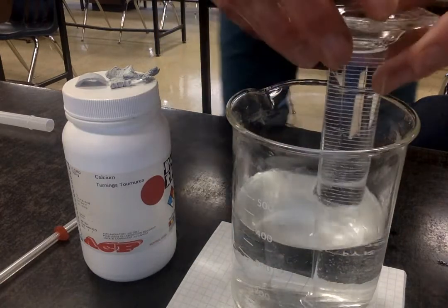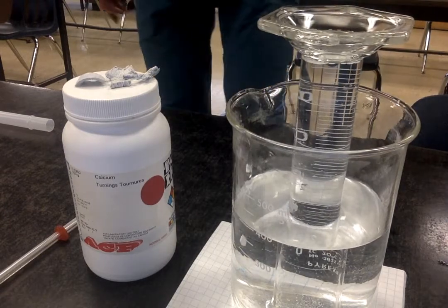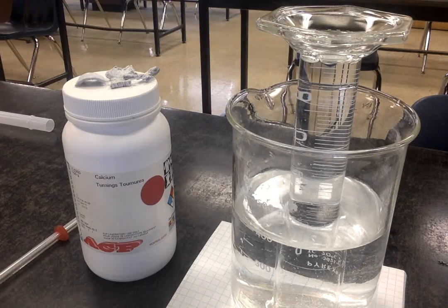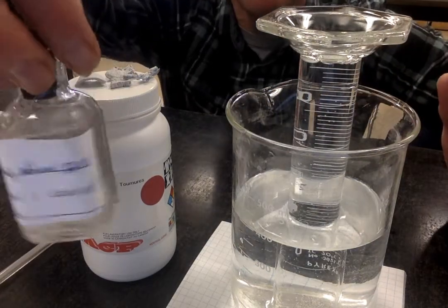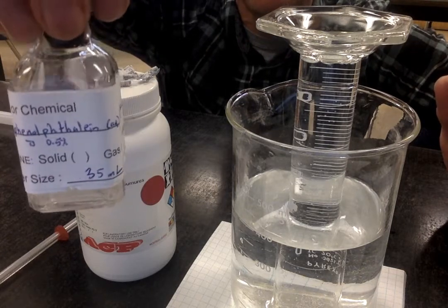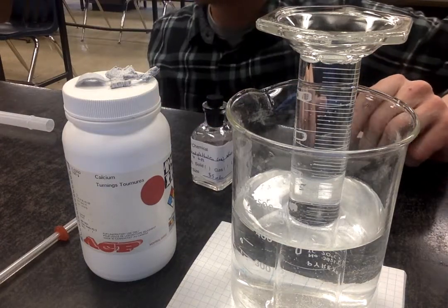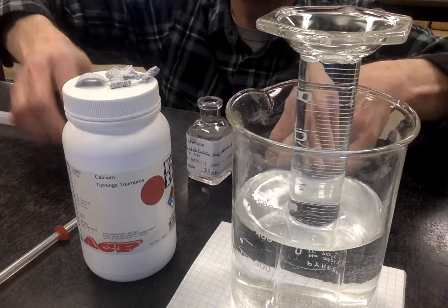I'm going to do the same thing with this other beaker right here. There. Also, in both of these beakers, I'm going to add some phenolphthalein. That is this liquid right here, phenolphthalein. Kind of hard to spell. There it is. That's also part of the method section. I'm going to use a dropper to get that phenolphthalein.